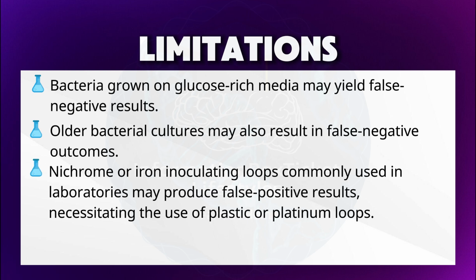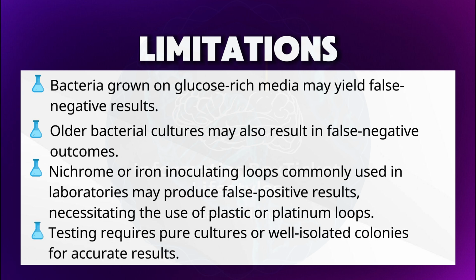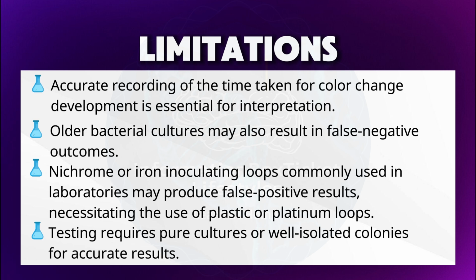Nichrome or iron inoculating loops commonly used in laboratories may produce false positive results, necessitating the use of plastic or platinum loops. Testing requires pure cultures or well-isolated colonies for accurate results. Accurate recording of the time taken for color change development is essential for interpretation.